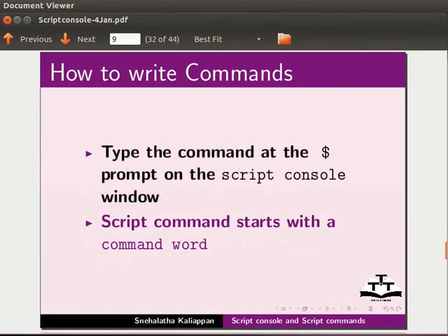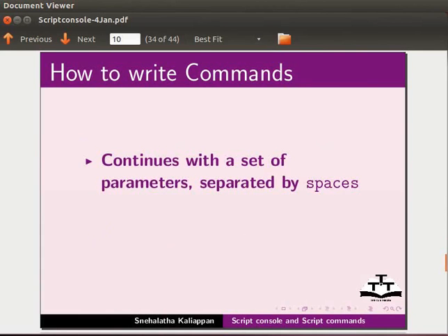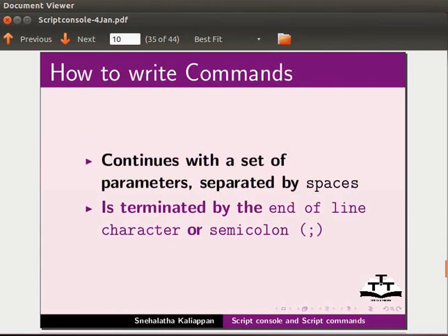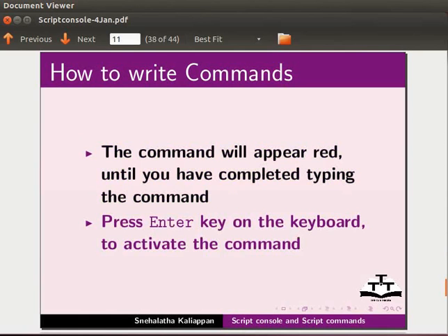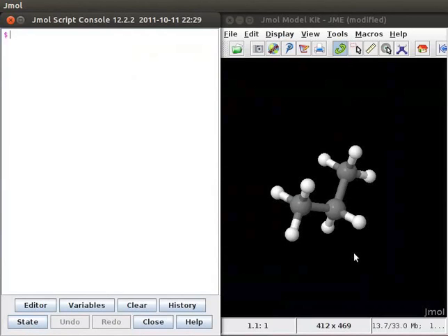Type the command after the dollar prompt on the script console window. Script commands start with a command word, continue with a set of parameters separated by spaces, and are terminated by the end of the line character or semicolon. The command line will appear red until you have completed typing the command. Press Enter on the keyboard to activate the command.